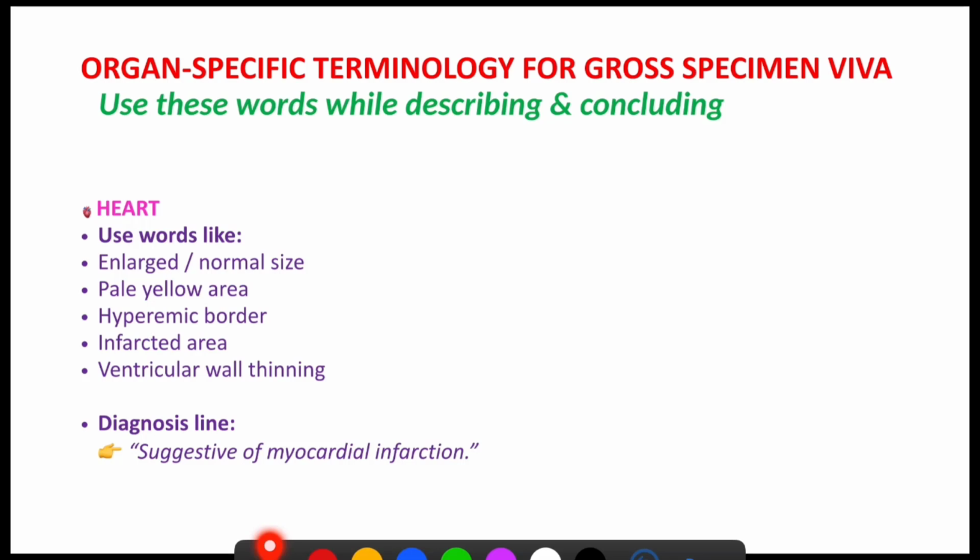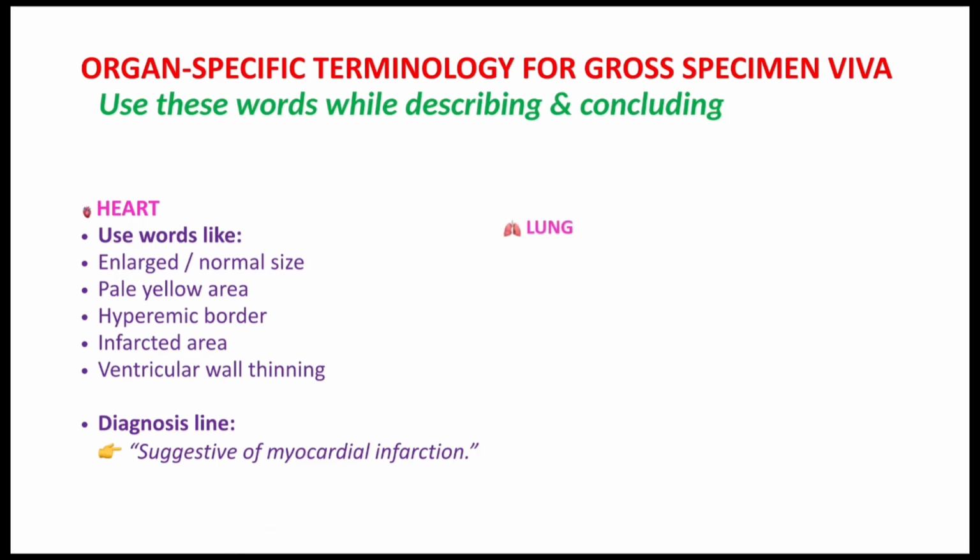According to this organ specific terminology, you have to describe first and the last line will be suggestive of myocardial infarction if these are the features.